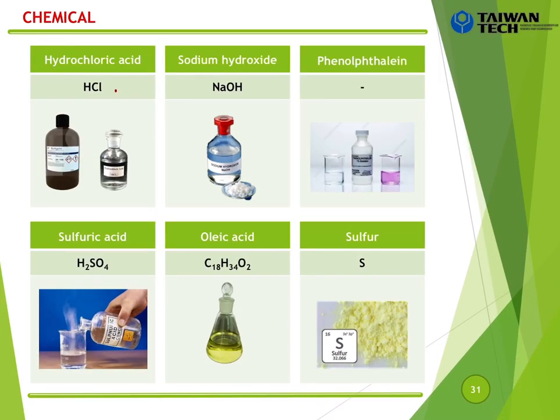The next one, we have acid HCl or maybe NaOH. So you can see here, colorless. You see, colorless, but actually it's dangerous, with the high concentration. Actually this one is the low concentration, like in your stomach. We also have HCl inside, okay? And HCl is a gas, and then it can dissolve in water to get the concentrated HCl solution. And for your use, you may dilute it with water to get the low concentration.